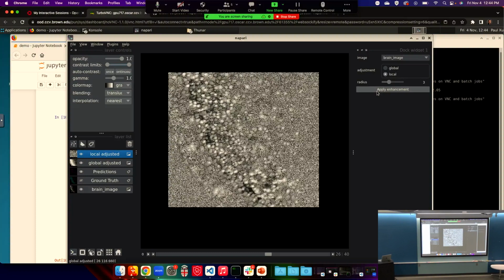Yeah, please. So is there an undo functionality in general, and in particular, is there anything that auto-handles that when you're adding custom widgets, or is it the responsibility of every programmer to keep track of any destructive actions? That's a good point.